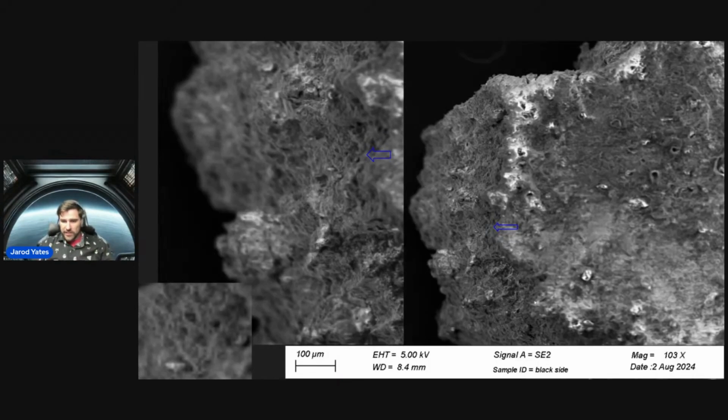All right, here is, again, the bismuth side. There was one thing about this edge that I thought was quite interesting. Right here, you can see these little divots here on the side in one of the shearing layers. And I thought that was quite interesting. We'll come back in towards the end of the talk, and I'll be showing you some other spots on the surface here, which seem to match that same pattern that you see there.